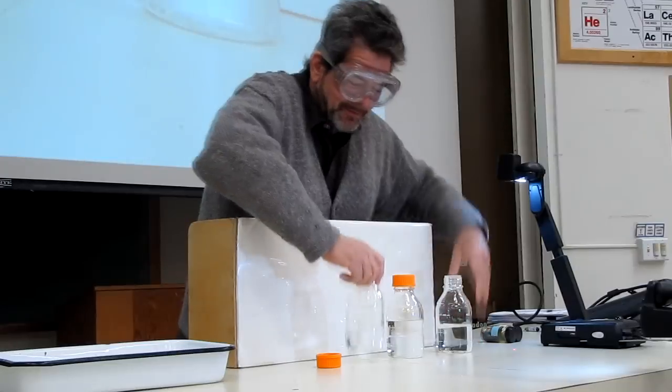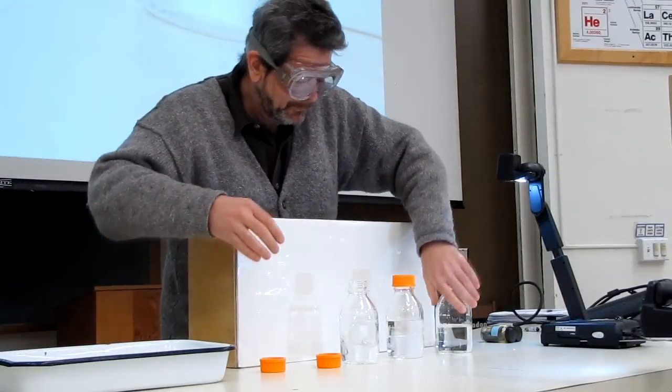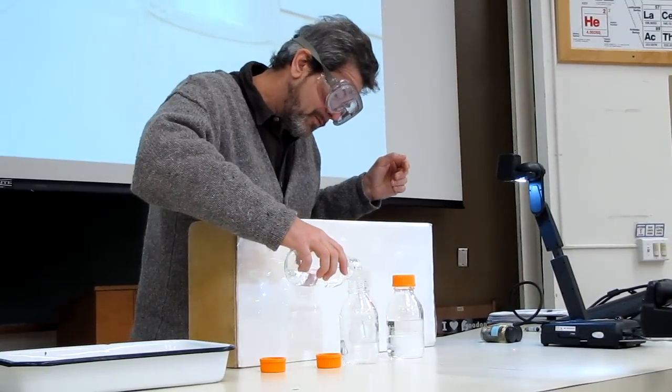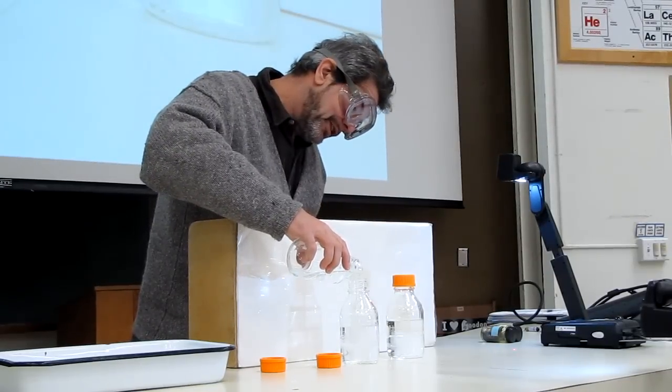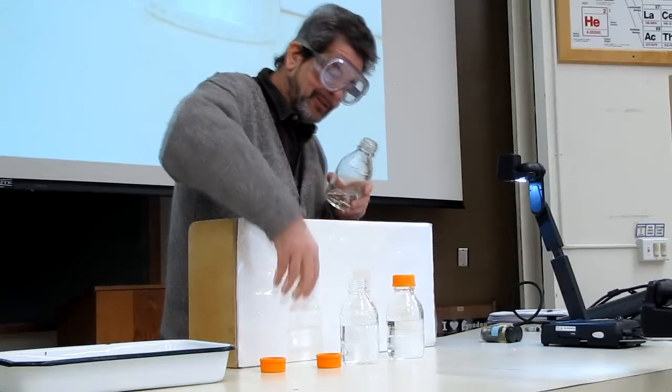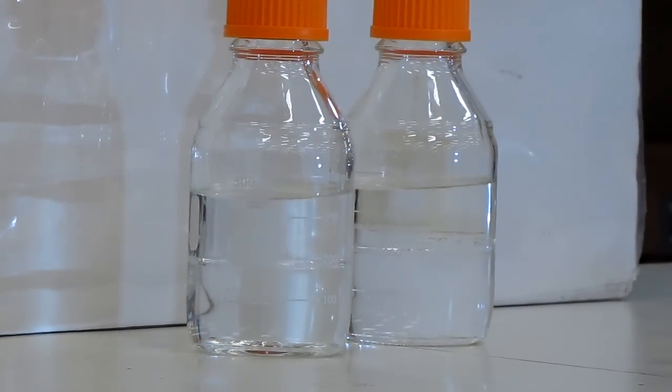So let's try it again. For my purposes I want to do this with two bottles. We should see the same thing. Water pouring through the hexane to the bottom. And we get two layers. Can you see the layers there? Yes. Can you see the interface between the layers?